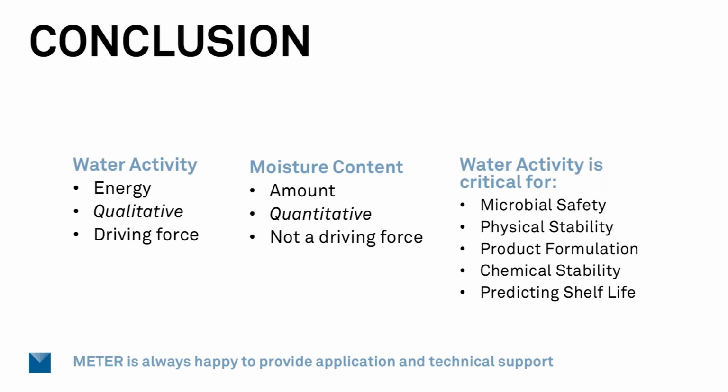Okay. Let's see. I think we've got time for one more question here. And for any and all of these questions, if your question has not been answered, we have these recorded, and Mary or somebody else from our Meter Food team will be getting in touch with you to fully answer your question. So, one last question here. Which is better, to measure the water activity in process or in the finished product?